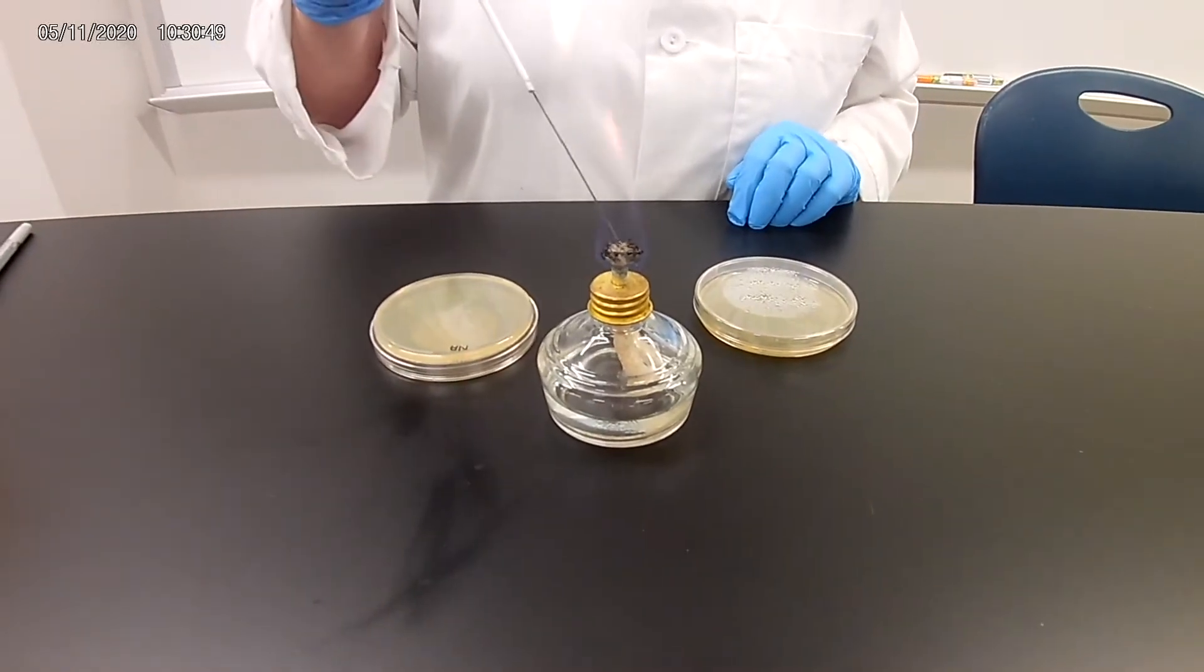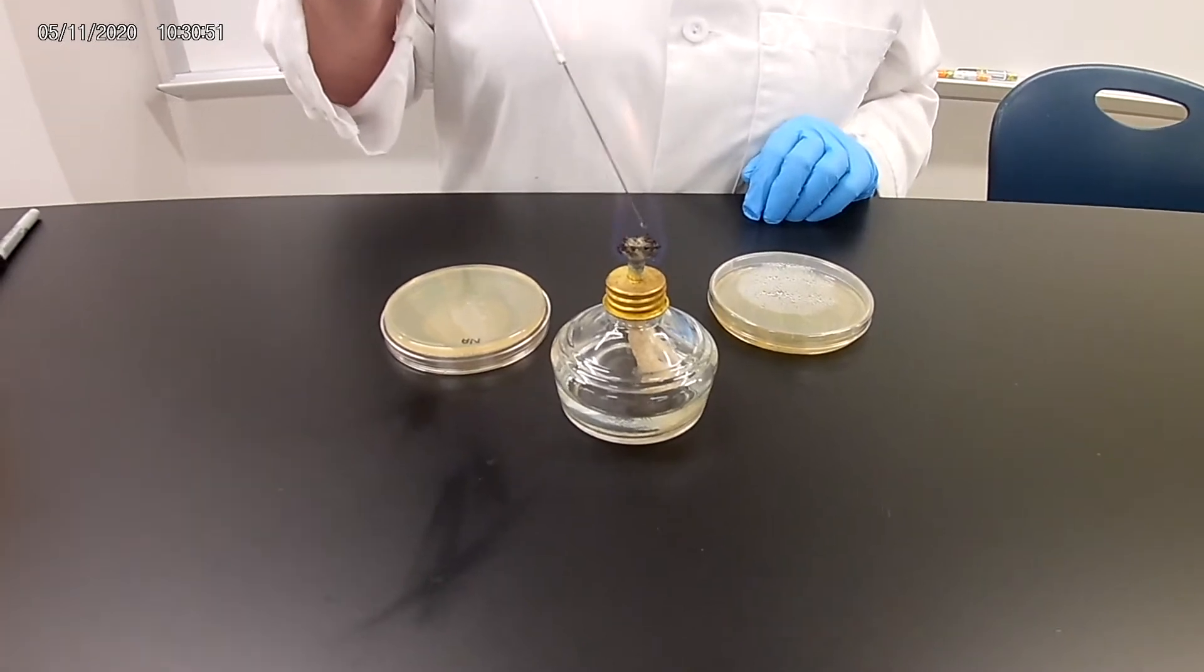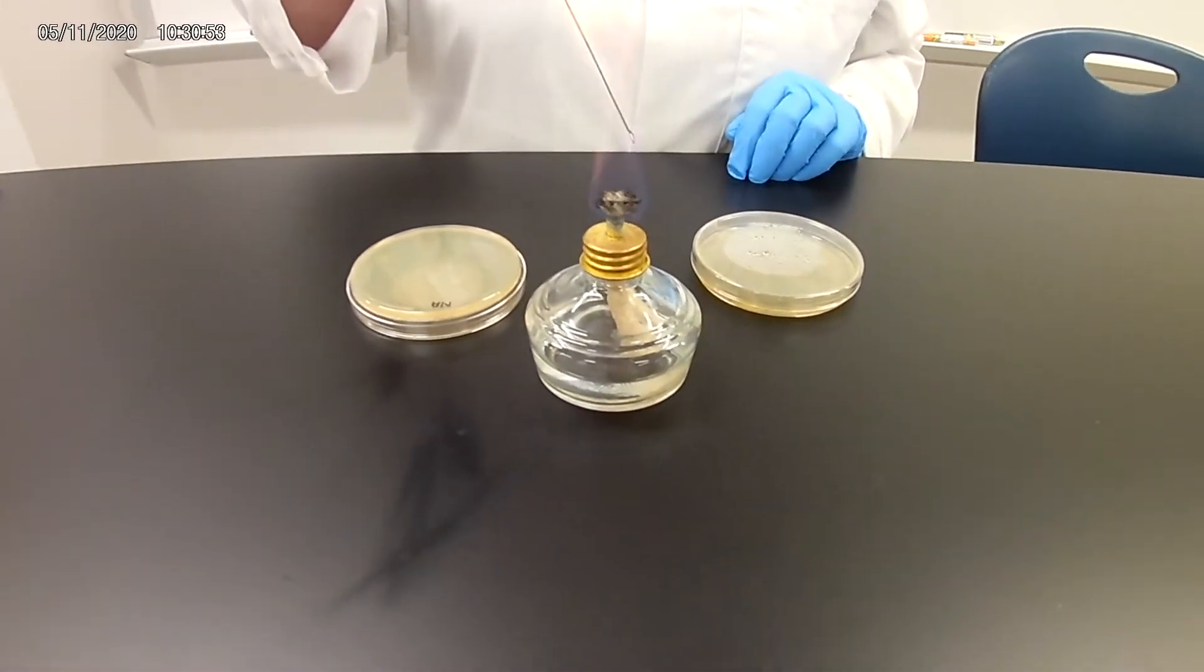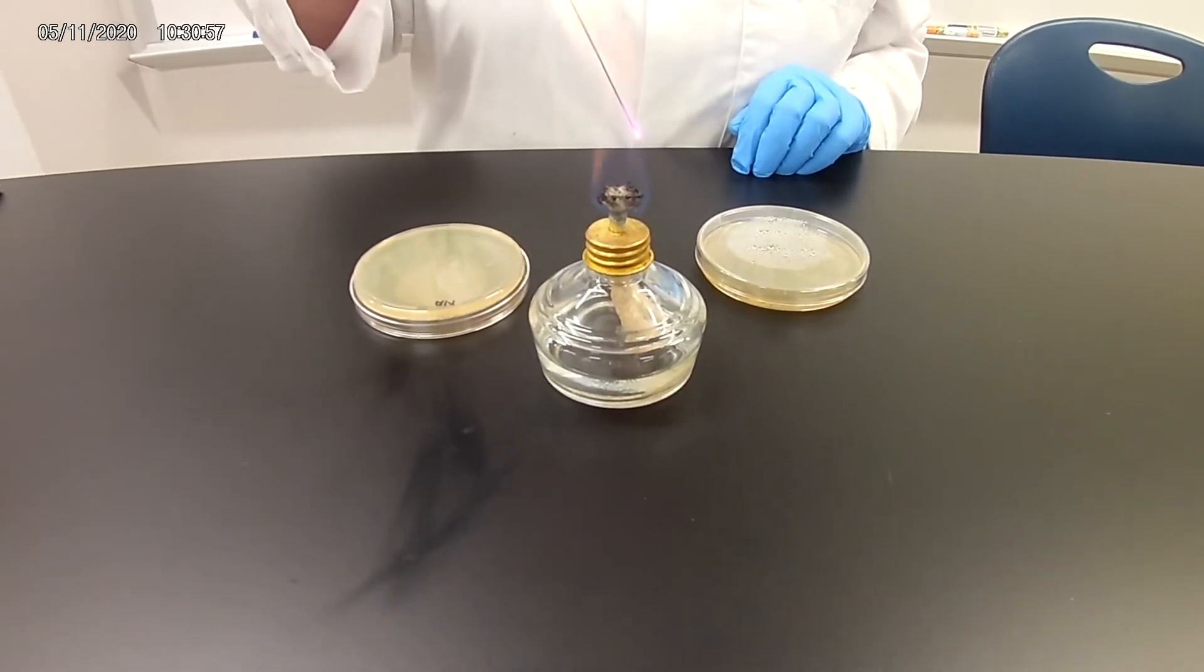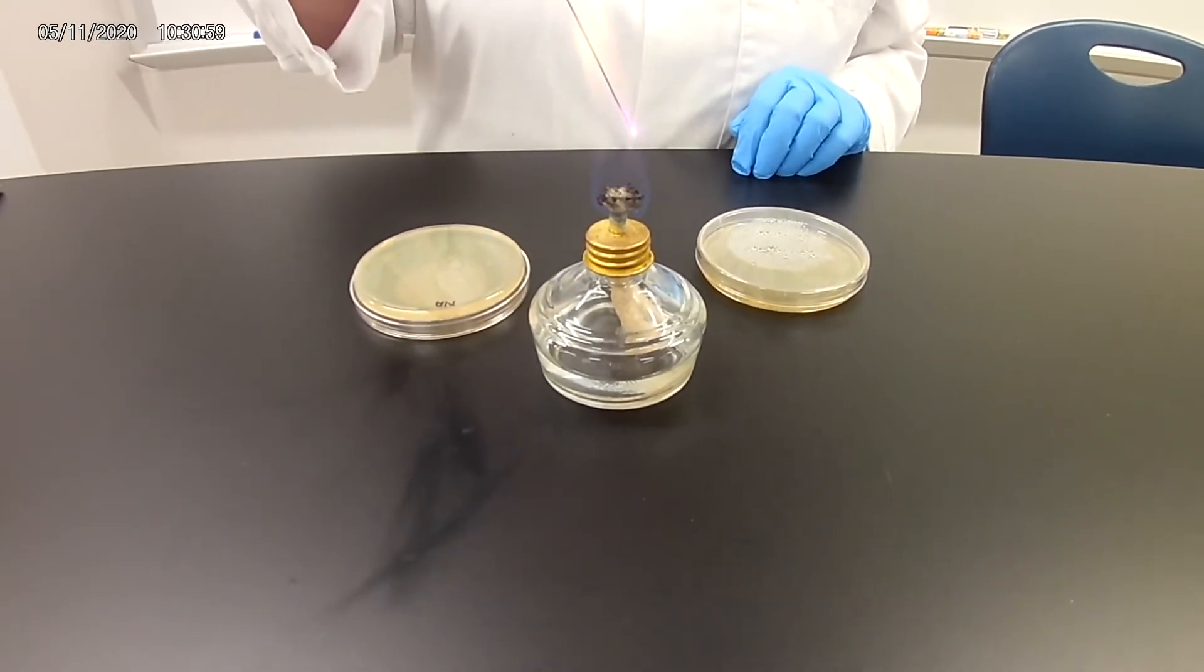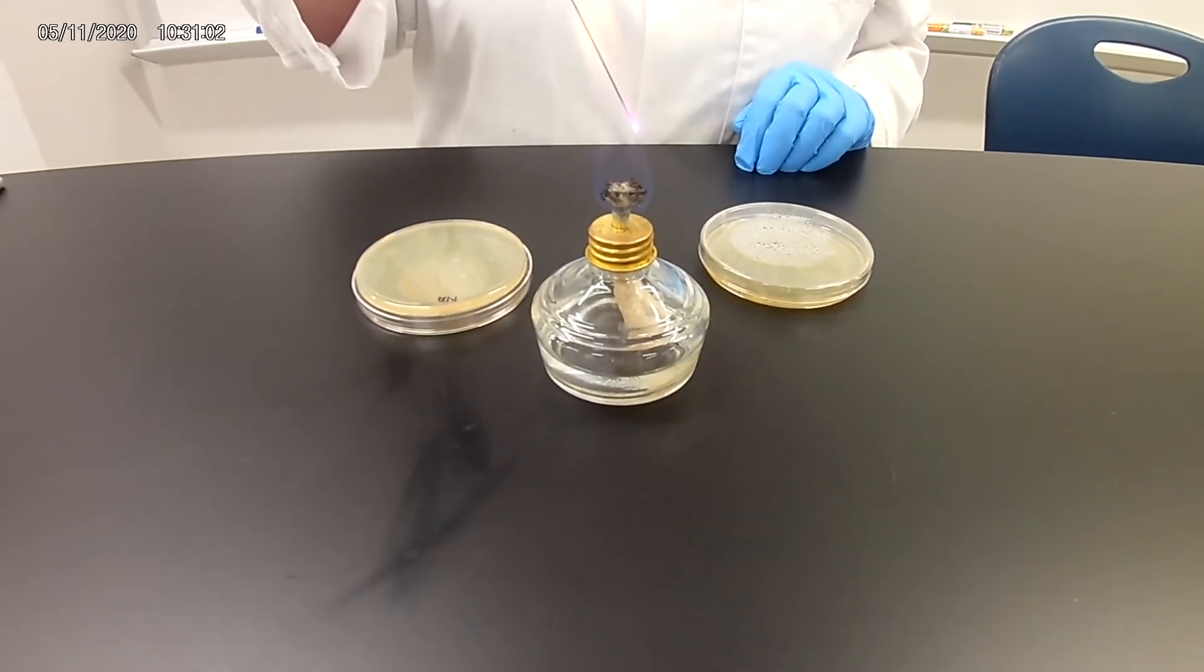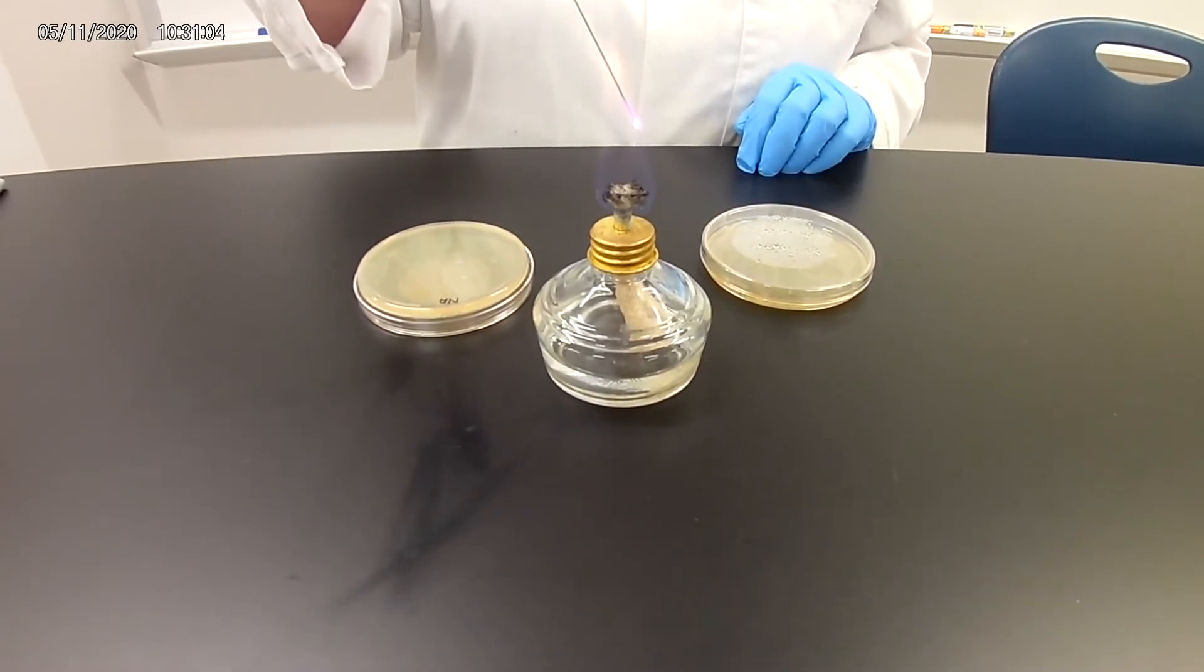Okay, today we're going to do a streak isolation. The idea behind this is we are going to inoculate a plate. We want to streak out or spread out the bacteria from the original inoculum until we have individual colonies so we have a pure culture.